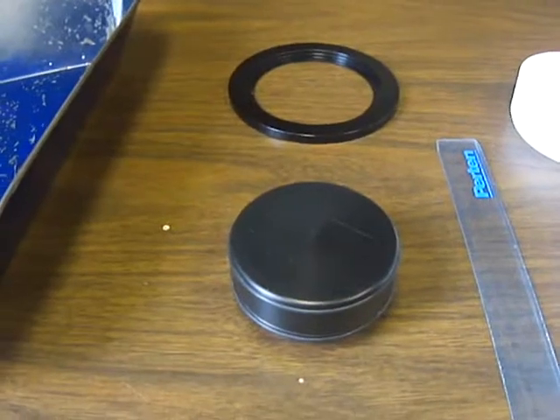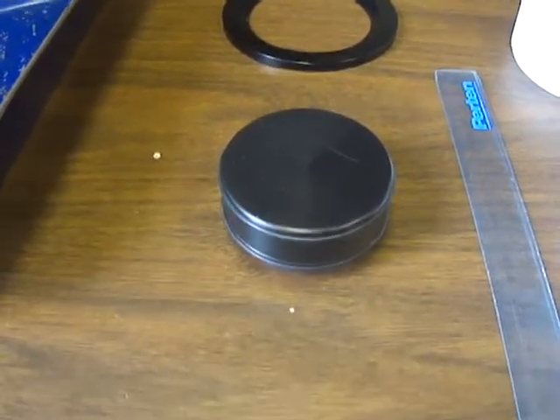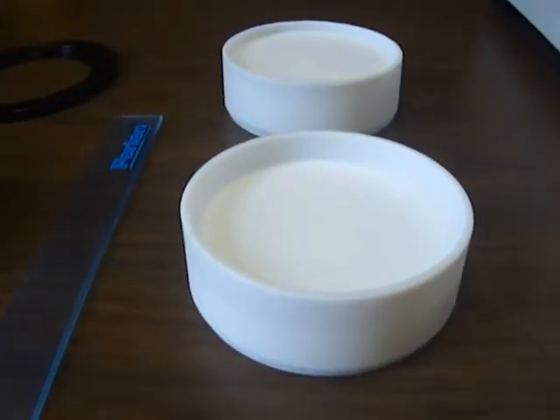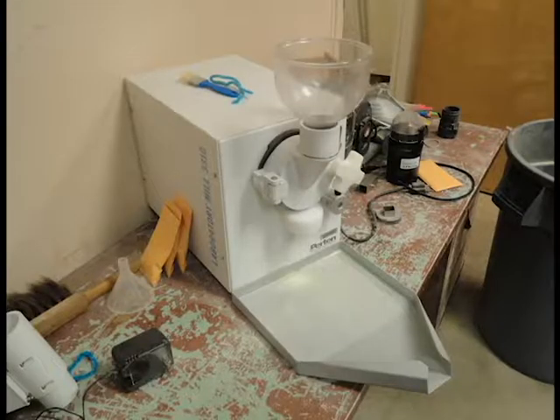Here are some of the tools we'll need: a tray, magnetic ring, polystyrene block, ruler, cups to hold the seeds, and seed samples. Seeds with dark seed coats may need to be ground using machines such as this in order to get accurate readings on the NIR.